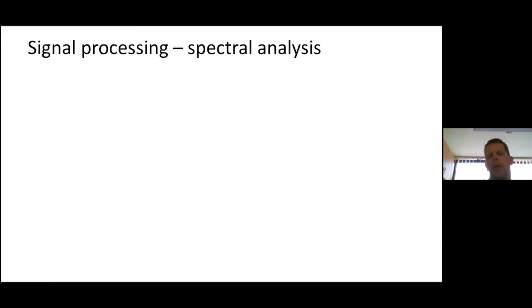So we do not, in modern NMR, measure these transition frequencies or energy splittings in a way that we would slowly sweep the frequency of the radiation and see at which frequency we have a larger absorption of energy and at which frequency we don't have absorption.